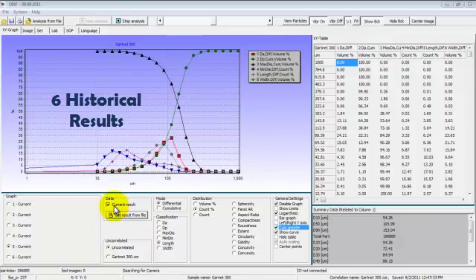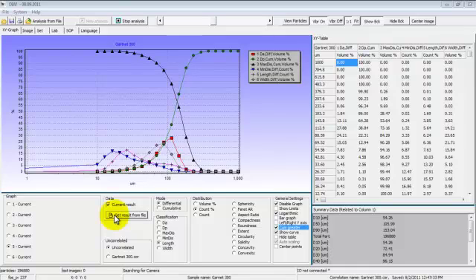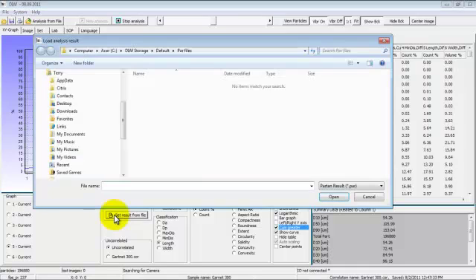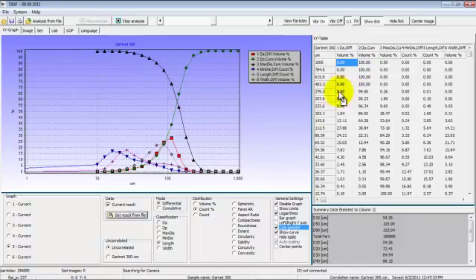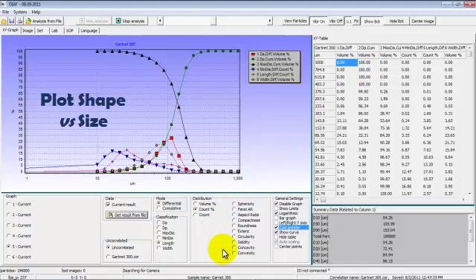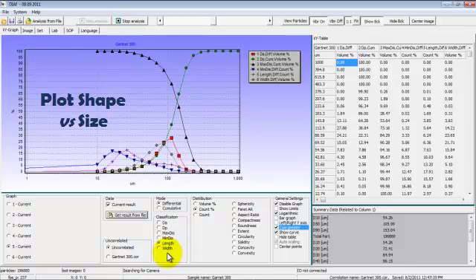Just check off the current result box and click Get Result from File, and browse to the files that you want to plot on the graph. Additionally, we can plot any one of these shape parameters against any one of these size parameters on this graph. All of these settings can be made in the SOP or Standard Operating Procedure.